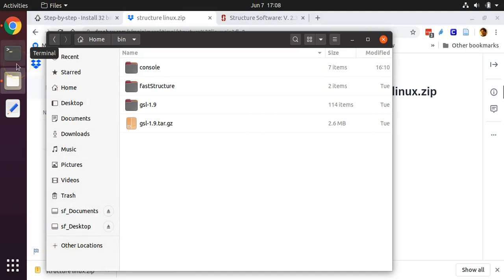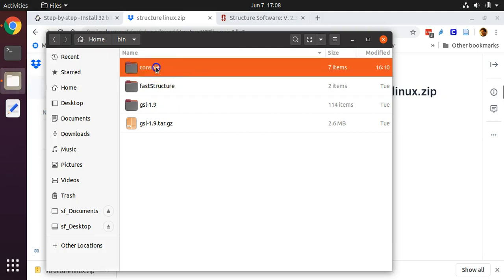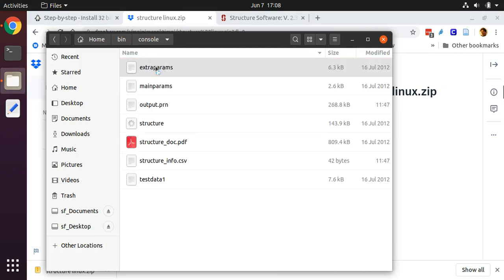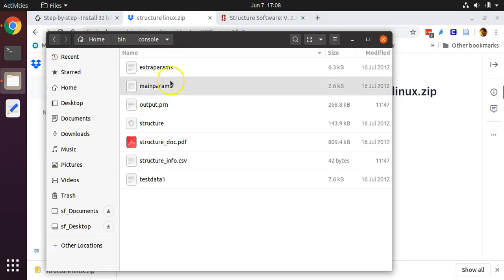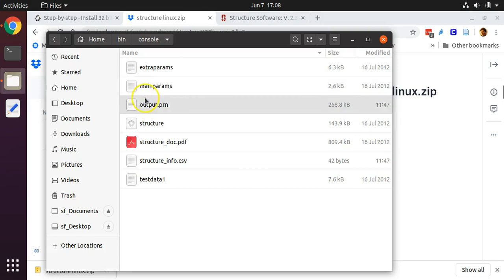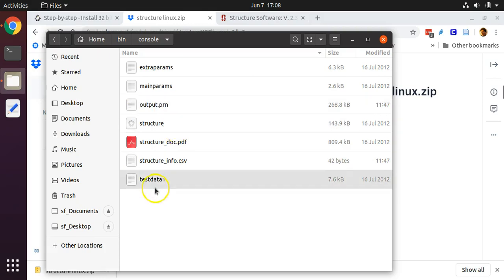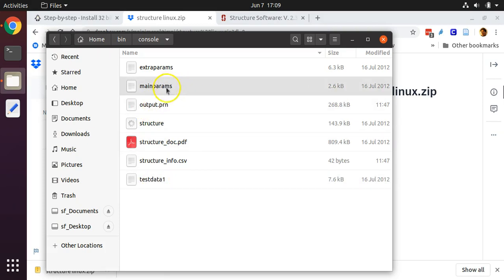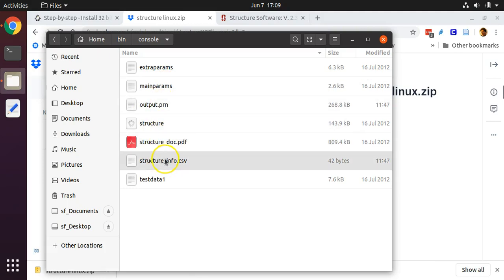We are ready to run STRUCTURE. Before we do, we need to alter these two files here called mainparams and extraparams. You will always need to alter these depending upon the specific data that you intend to run in STRUCTURE. We will be running this file called output.prn, which I have provided to you, which is some sample data. I also have included a file called structureinfo.csv, which includes information about the number of loci in my dataset, as well as the number of individuals in the dataset.